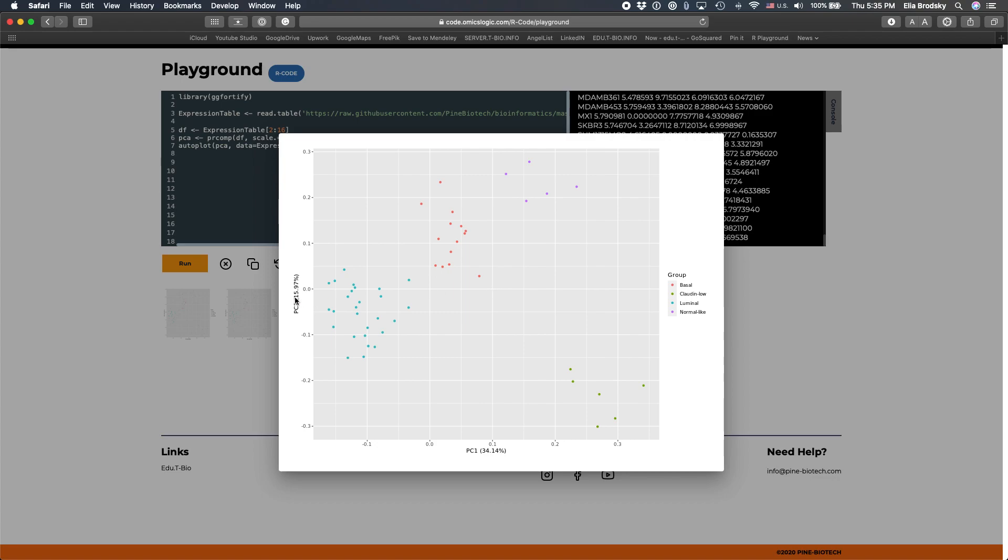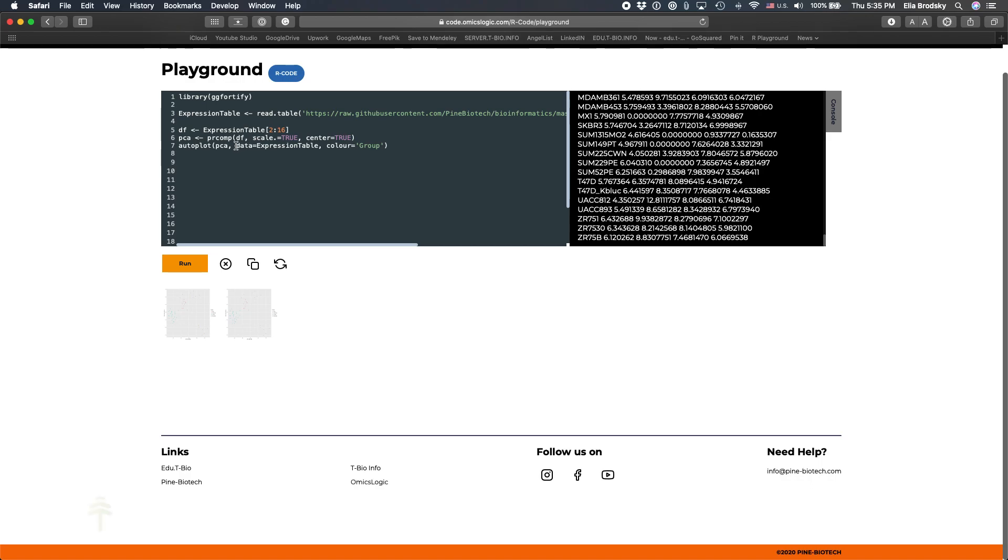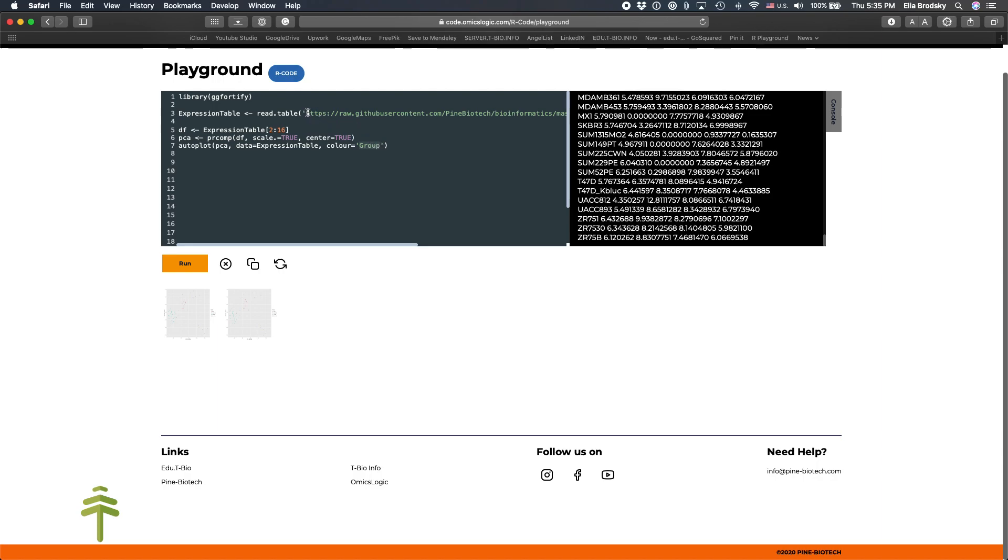So what we get is a pretty nice chart that you can use directly in your reporting of whatever data you've analyzed. And it's a very simple script that literally has one, two, three, four, five, five lines. And importantly, don't forget that this color comes from a column. So this should be an actual column name in your source data.